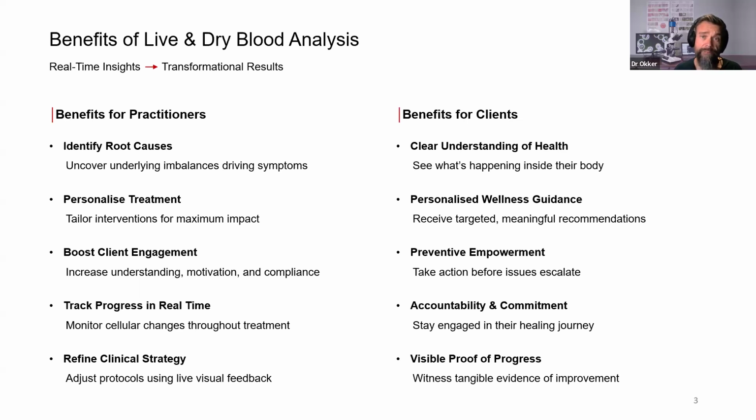So we can actually show them the impact of dietary and lifestyle choices, how it's affected their health, and it actually clicks for them. Often they understand that, oh, this is actually where things are coming from, and if I make these changes, things would be better. And then we can actually show them how things improve. There's not only an improvement in their symptoms, but they can actually see a substantial improvement in the way that their blood looks when it's analyzed.